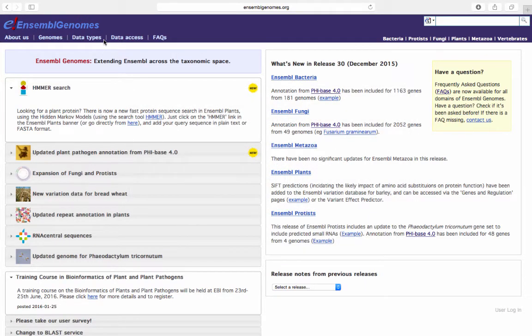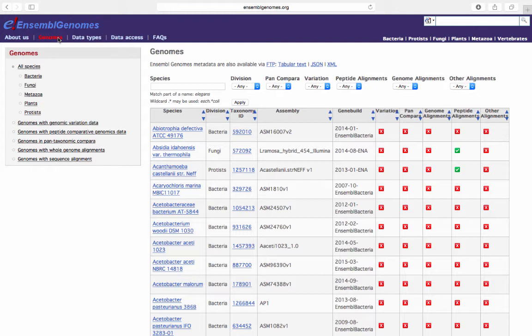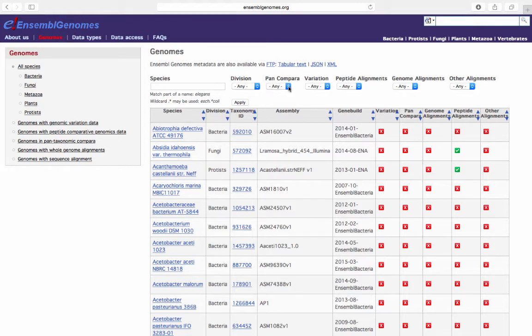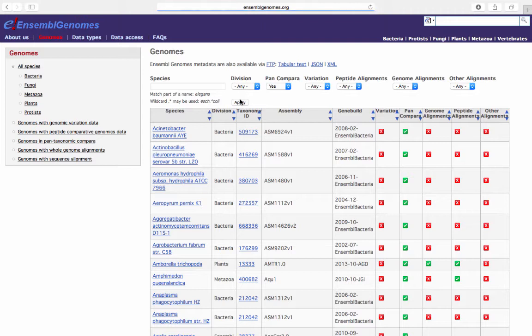The species that are available in Pan-Compara can be found by clicking on the Genomes link at the top of the Ensembl genomes homepage. Here is a list of all the genomes available from Ensembl and Ensembl genomes. The list can be filtered by a number of different parameters, including whether a species is available in Pan-Compara. Click the drop-down list for Pan-Compara. Click Yes. Click Apply. We can now view all of the species available in Pan-Compara.